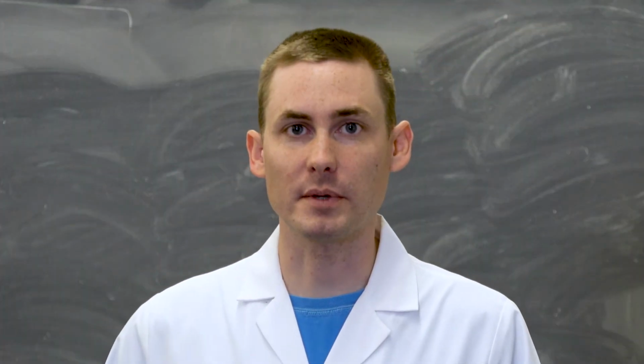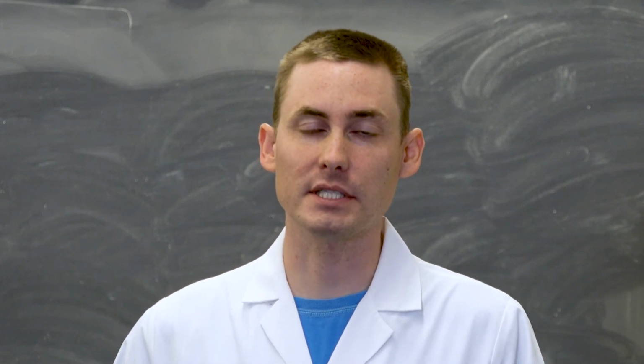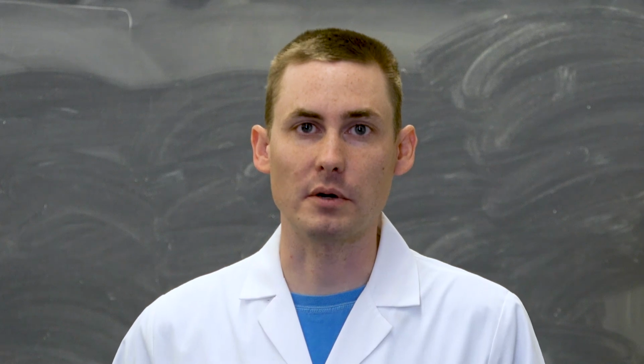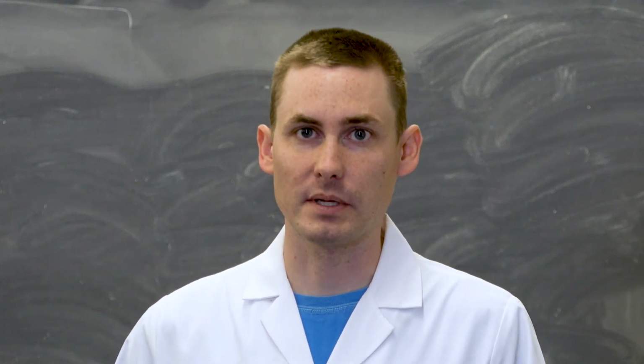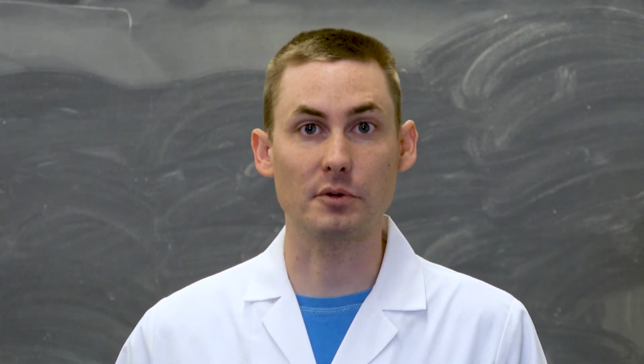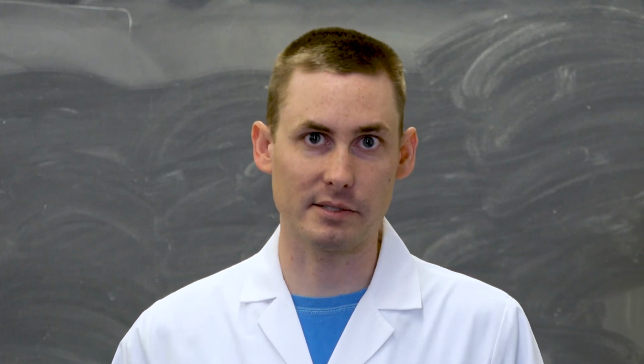So once the solution has become a pale yellow color, you have reached the end of the titration and you can record your final volume to use in your calculations for the rest of the lab. If the solution color is more of a red color or a pink, you have overrun the endpoint and you need to repeat the titration and get that nice pale yellow color.